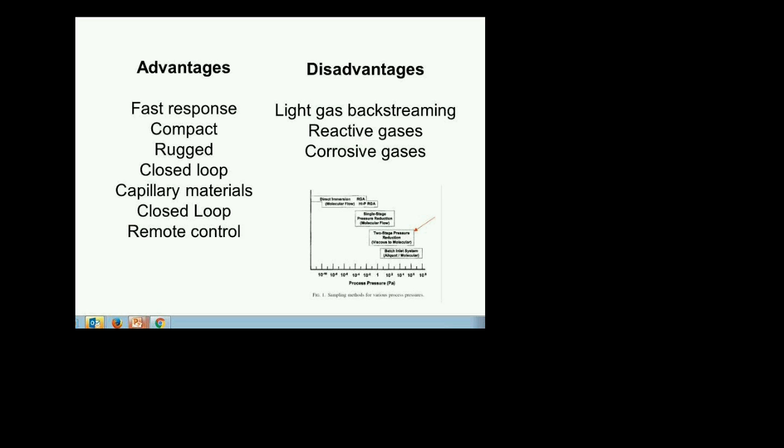Well, I need to give them two outputs, like long chain and short chain. So I need to break it into two halves, right? Okay, and how are you going to do that? I don't remember, but I think there is a spec. I have to get a 200 atomic mass unit RGA and measure all the way up there. So you're probably breaking the range into two. Yeah, I think it's 45 to 90 and then above 90 or something.